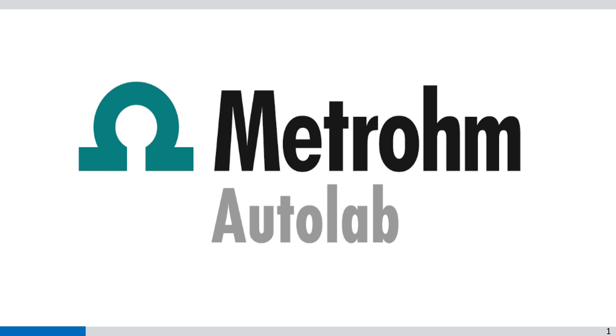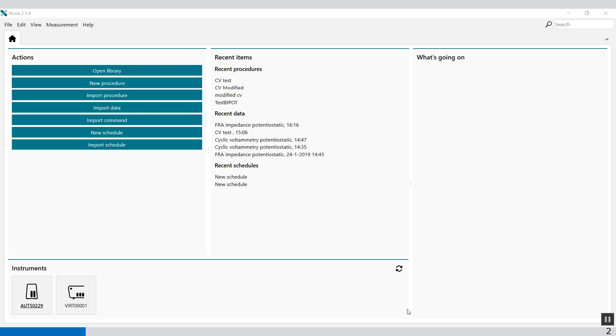Welcome to the Outlaw getting started video. In this video I'm going to show you the FRA impedance spectroscopy procedure.